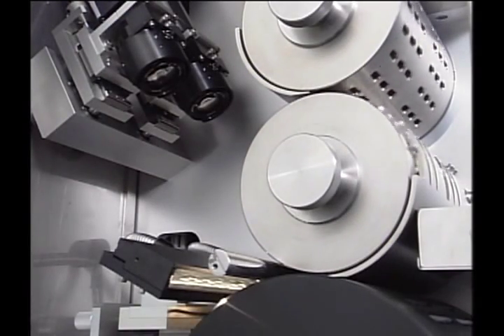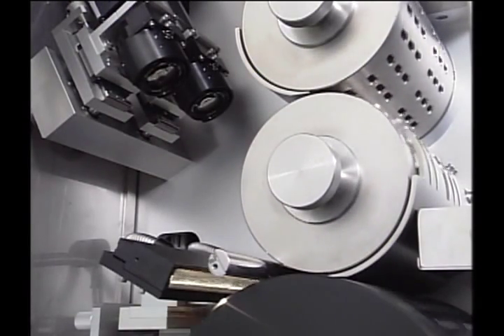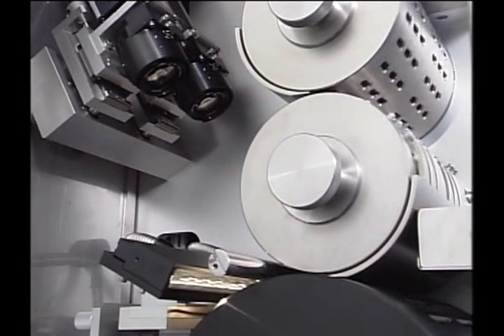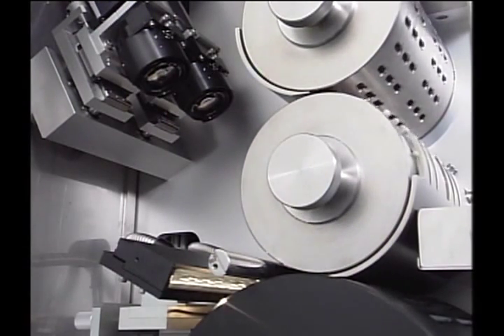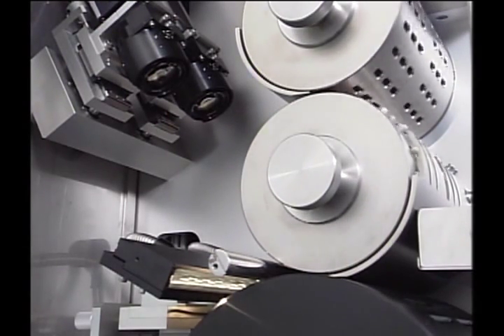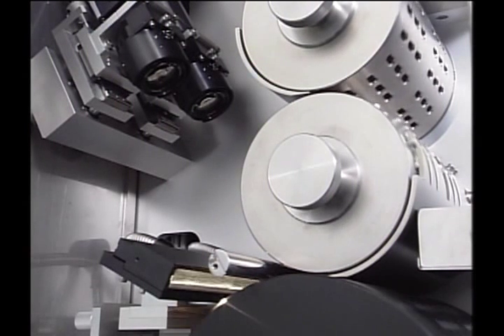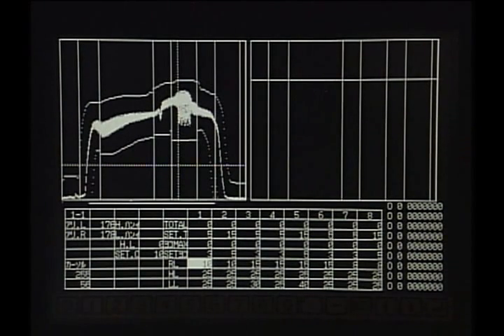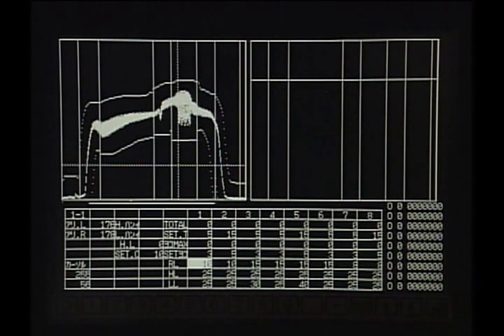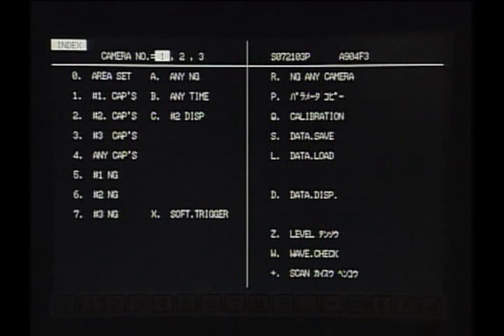Therefore, we can achieve a large increase of good quality products. In consideration of the combination of colors for the cap and body in the printed area, the capsules are divided into eight sections in the direction of the long axis. It is possible to inspect precisely and with high accuracy by setting the inspection parameters in the block.